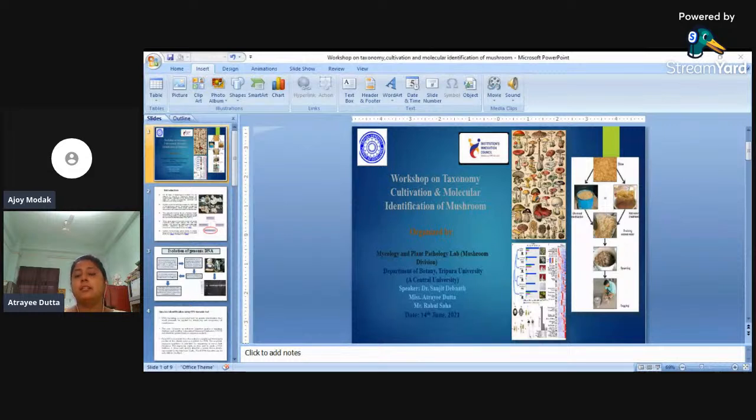This phylogenetic tree shows how the mushroom species are closely associated with each other, or how much they evolved from each other, and in which position they are associated with each other. So we can easily identify all of this data from the phylogenetic tree. The most important advantage of this technique is that molecular identification enriches and provides additional information to mushroom biodiversity and the GenBank database, a resource aiding molecular phylogenetic analysis.